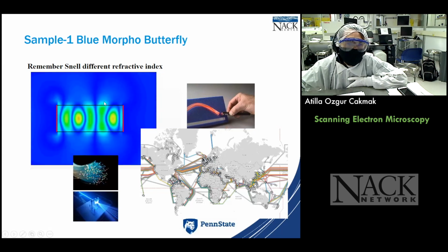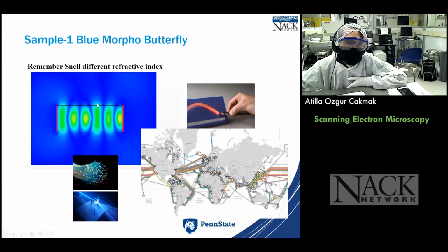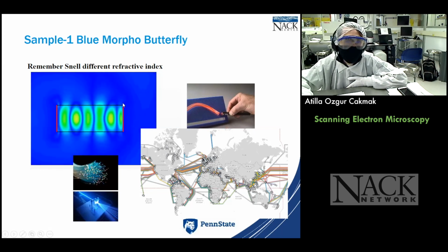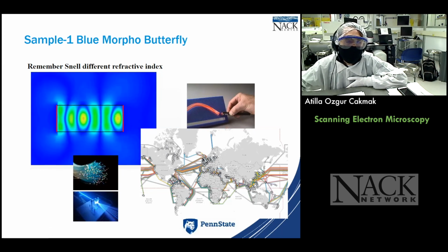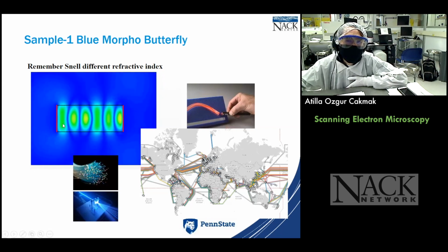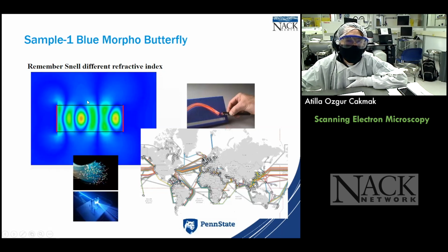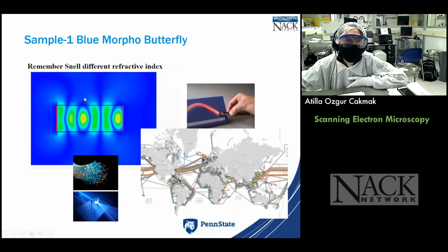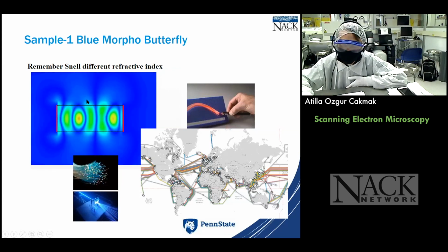But look at these leakages. There's still quite a bit of leakage going to the outside, right? So that's something not desirable, because you lose that much information. And if there is someone here listening to what you guys are talking about, there is a possibility that they can decipher or understand what's going on. So this leakage is a good amount of information for them to understand.